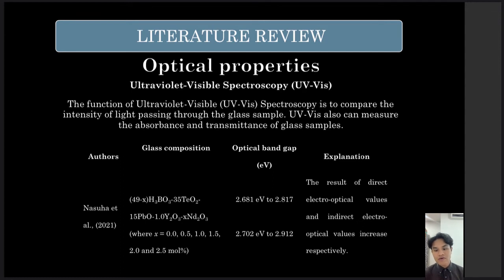As you can see below is an example from another research written by Naswa et al. By using the glass composition below, the optical band gap can be seen. The direct optical band gap and indirect optical band gap values increase respectively.